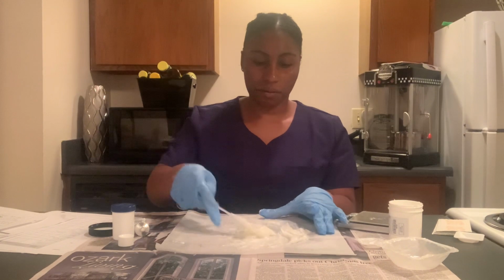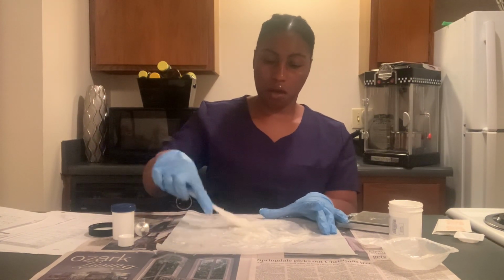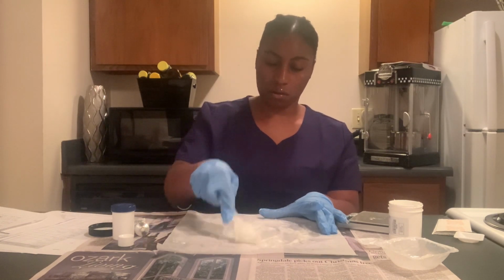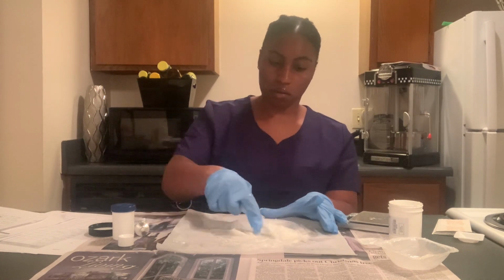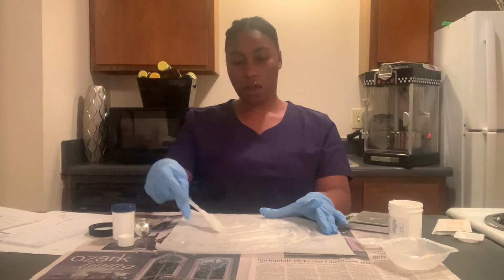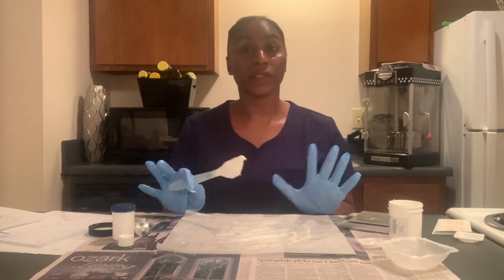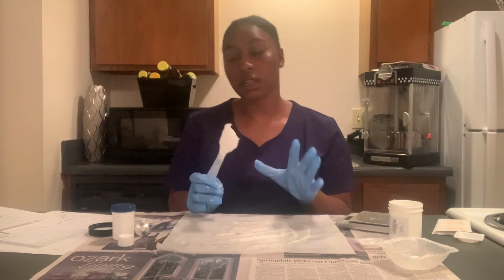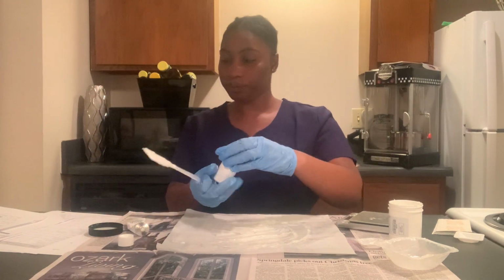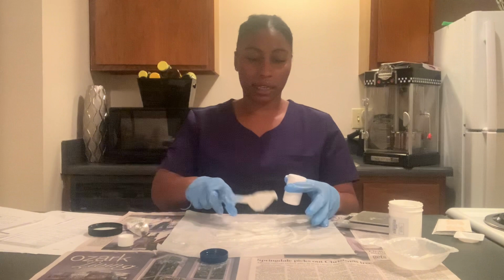Okay, yep. Okay. There's that. So next we're going to put the contents inside of the empty bottle, in the ointment container.